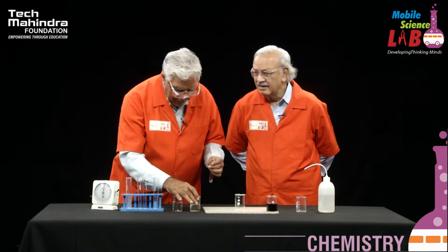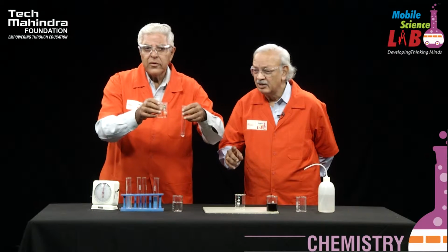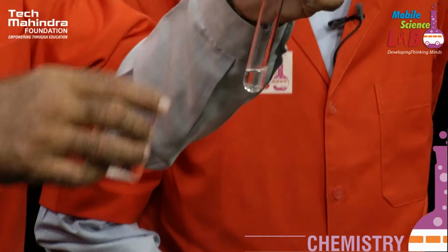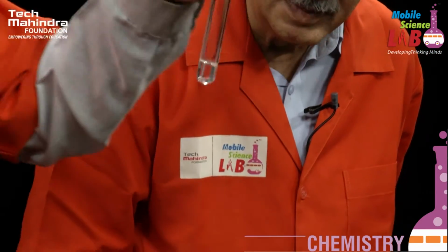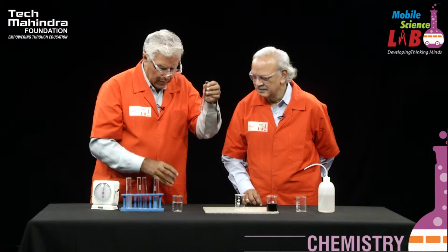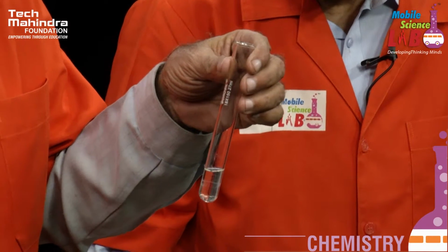We just add directly persulfate and iodide. Remember earlier, iodide was the last solution to be added because there is a direct reaction between these. I'm just adding a small quantity. Or shall I add some more? Yes, add some more. That's it. And to that you add iodide directly.